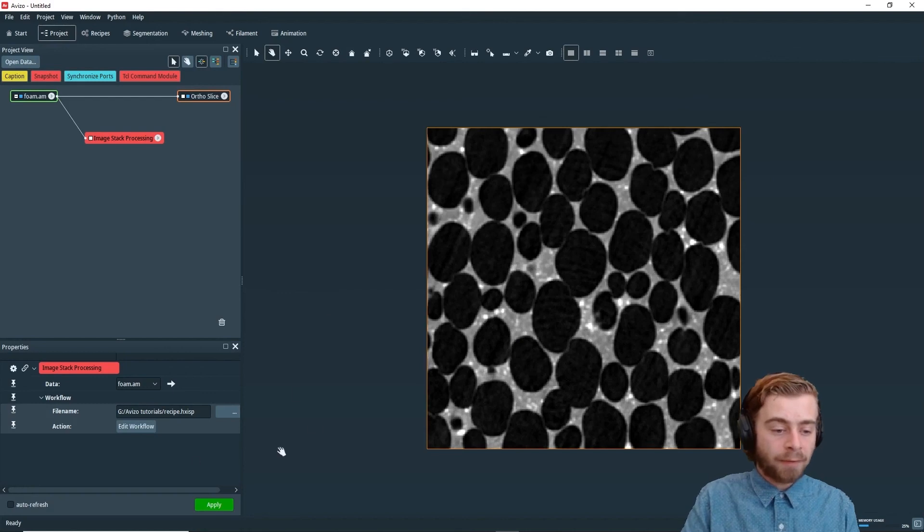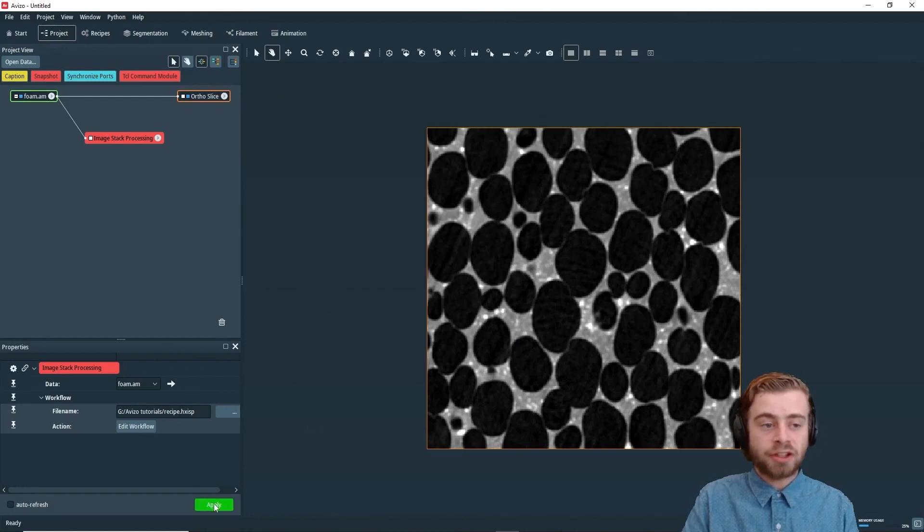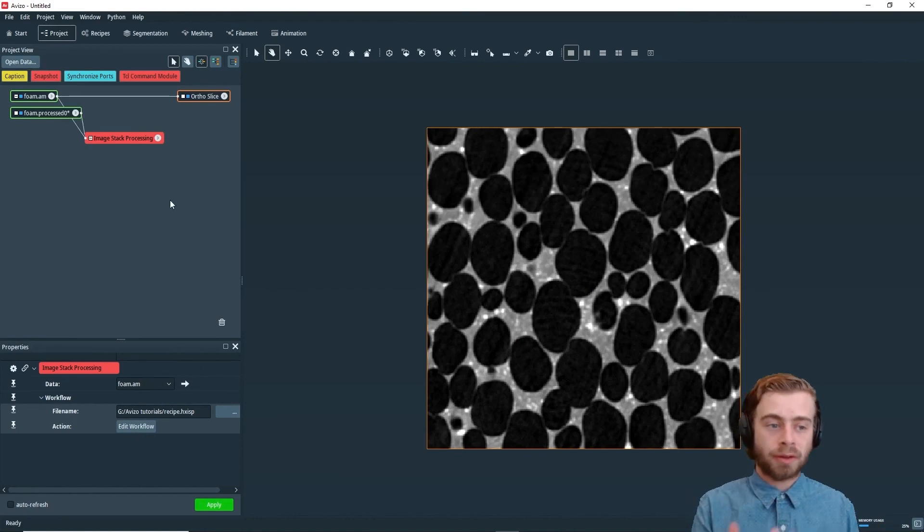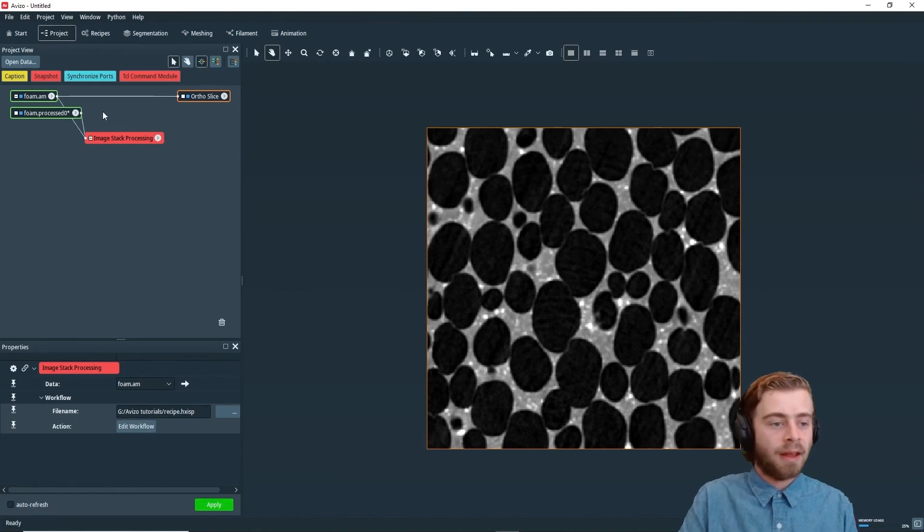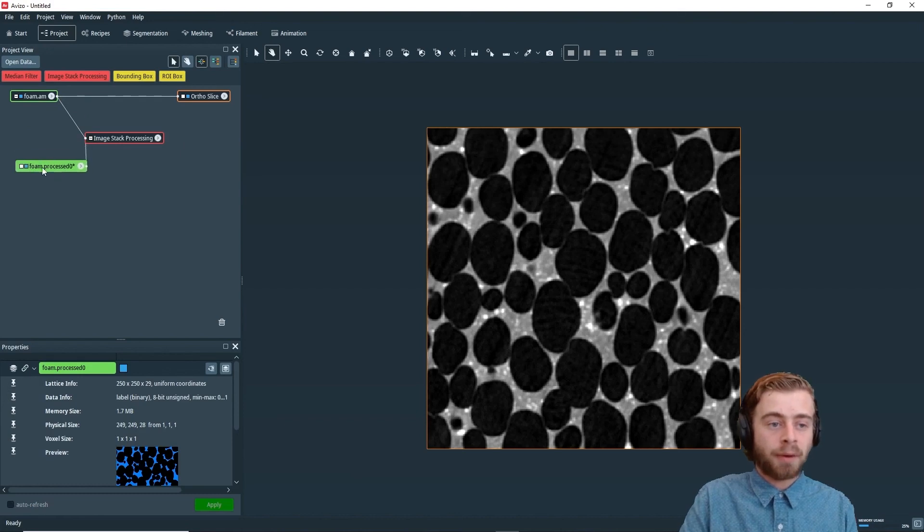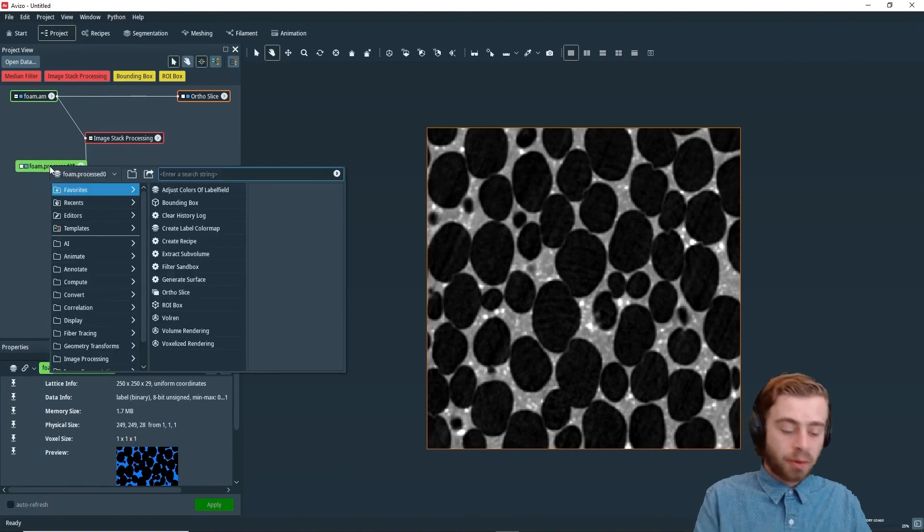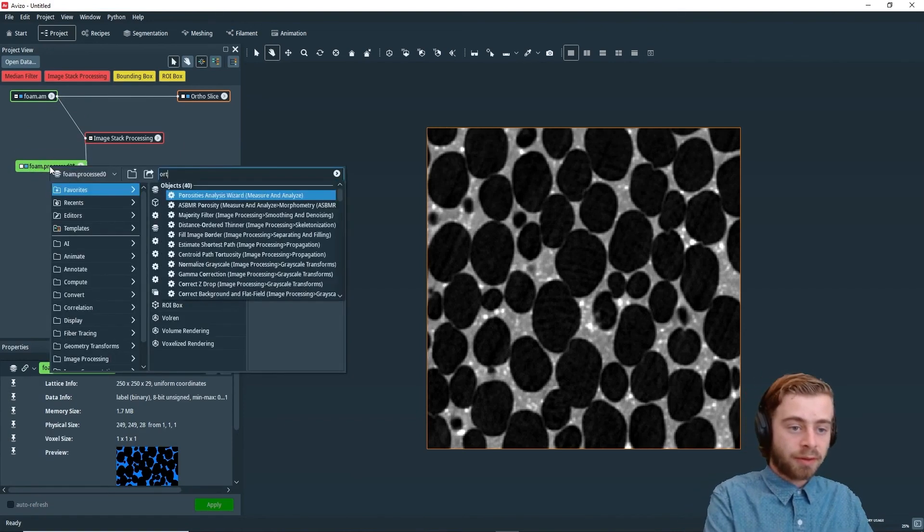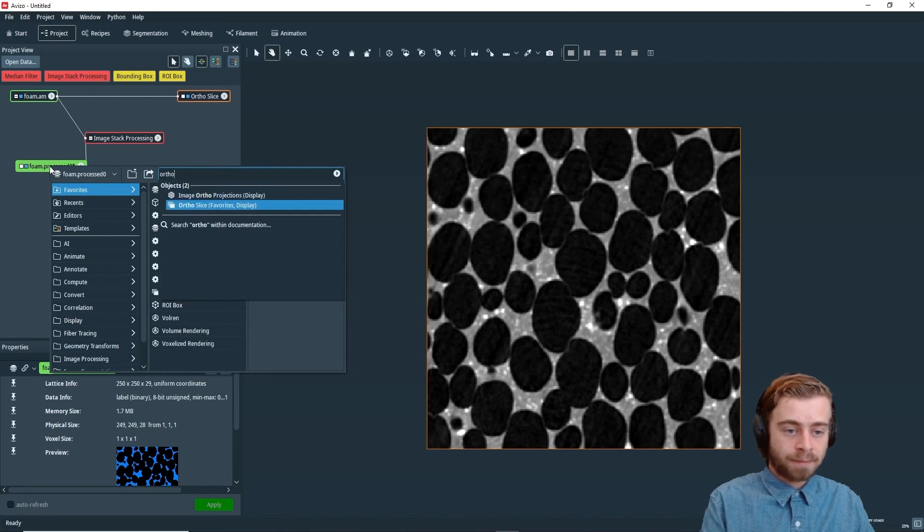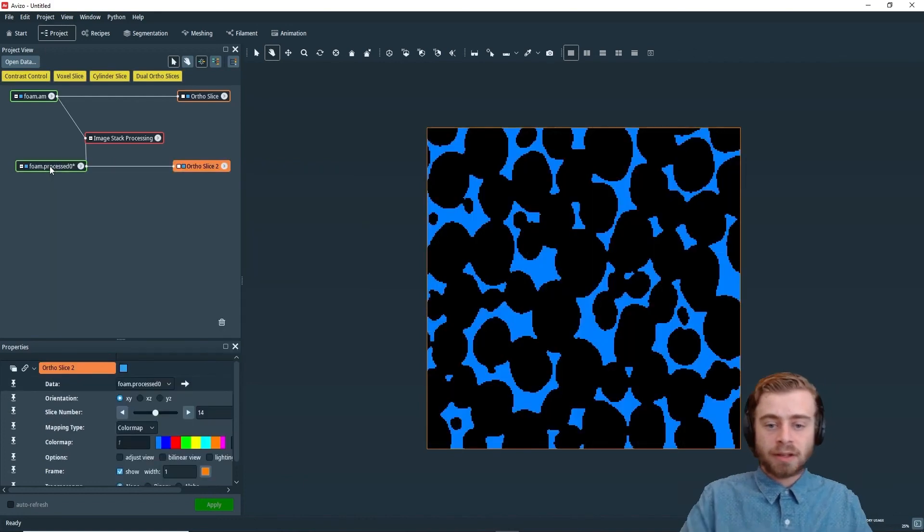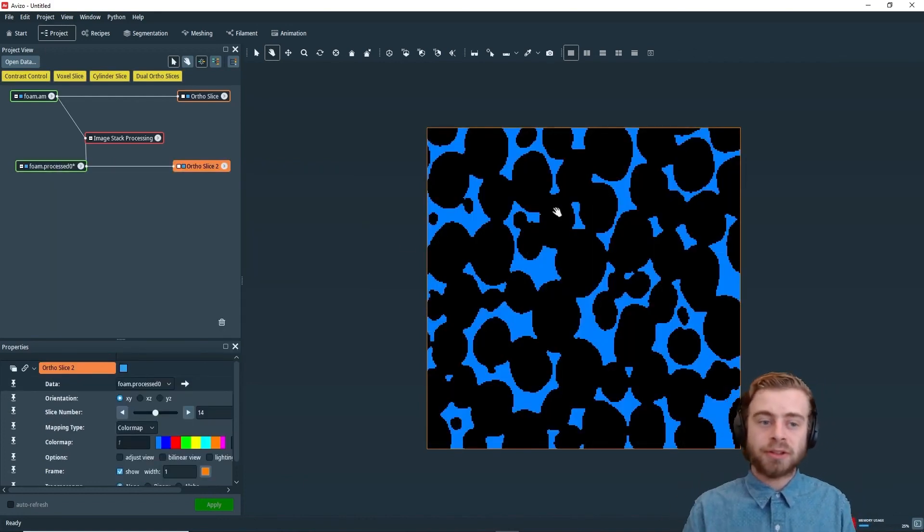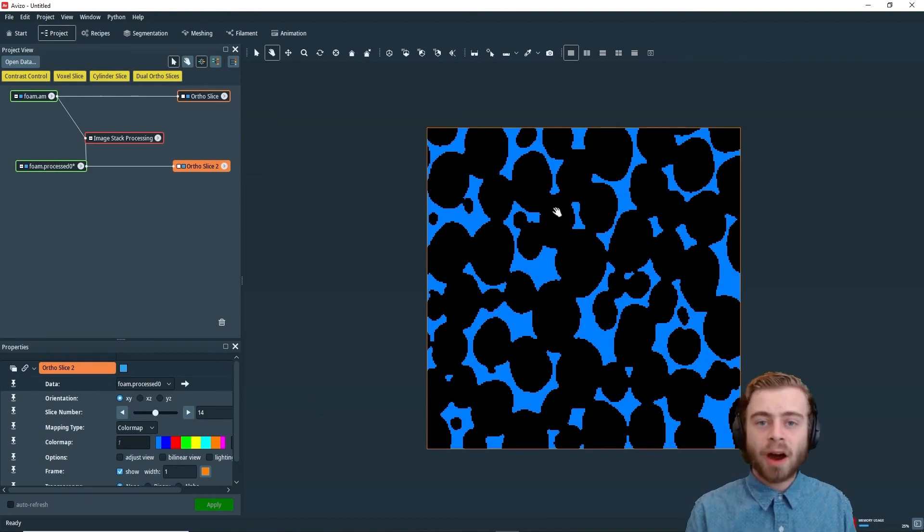So now we have our workflow in our file name right here. And we can just click apply. And it will apply the workflow to the foam dataset. And we can see the output foam dot process. And if we use an ortho slice to view the dataset, we can see that it outputted the thresholded version of our dataset, which is exactly what we wanted.